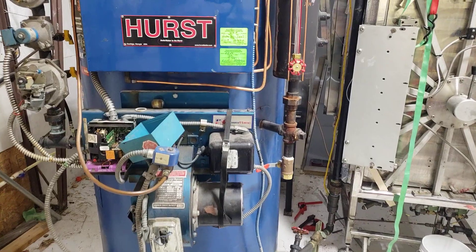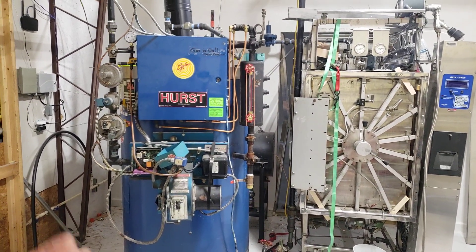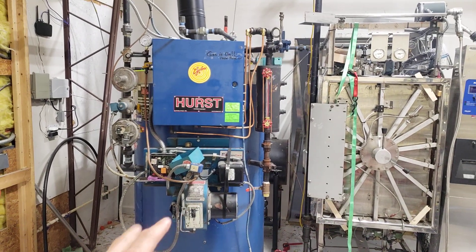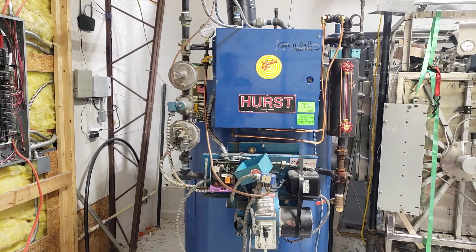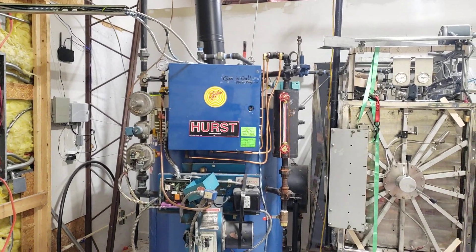Once you have everything set up, you'll have the fire marshal come out — they actually came out earlier too. The fire marshal ensures all the clearances are correct. In my state, the entire autoclave and boiler setup is under their jurisdiction, so they verify working clearances, exhaust specs, and clearances, and then issue the certificate.